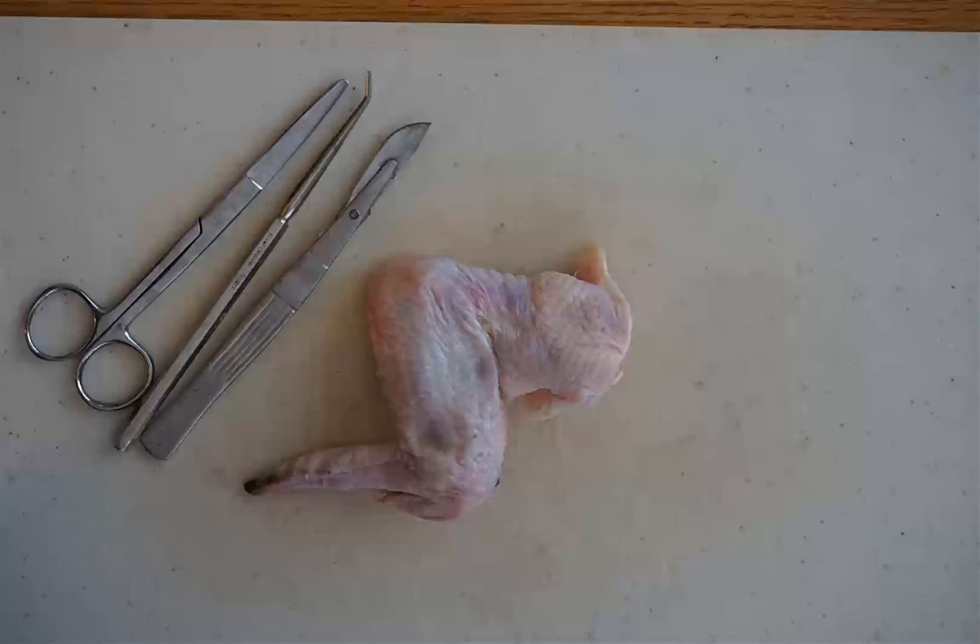Even though you're obviously familiar with chicken and dissecting it just for cooking purposes, make sure you wash your hands when you're finished or use gloves so you don't transfer bacteria around your house. Also make sure that you take your time, because this lab won't work properly if you don't take your time while you're dissecting.